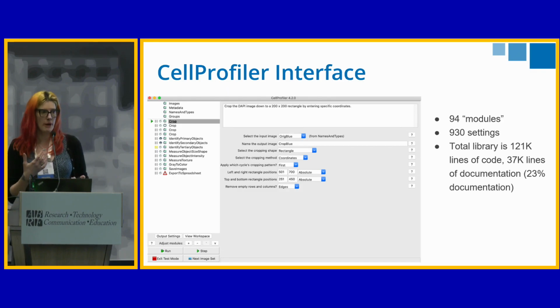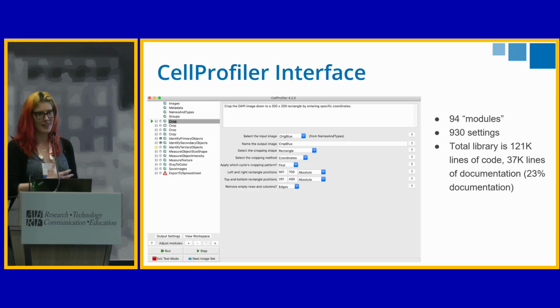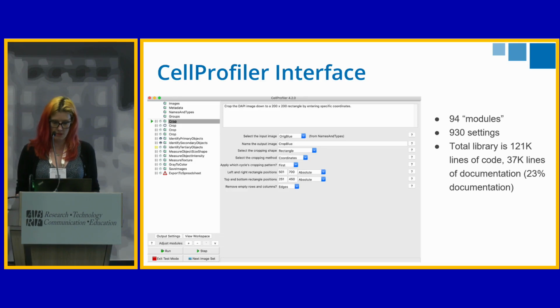And so any biologist, you don't have to code at all to use CellProfiler. Any biologist can take whatever modules they want, drag and drop them into this workflow pipeline here, tune them however they want, and use them to analyze their images.